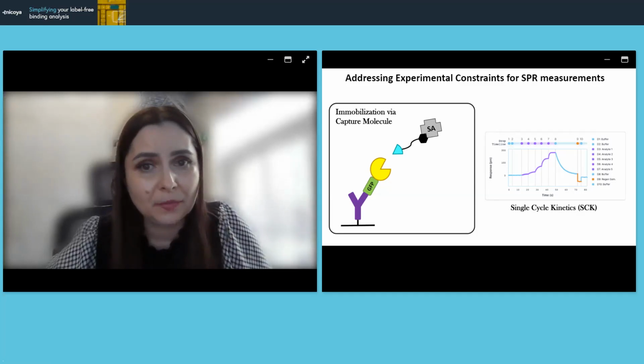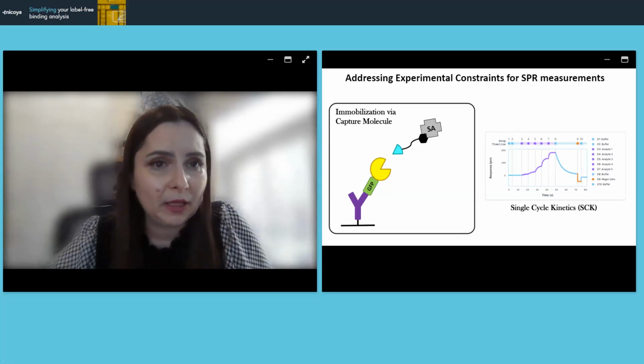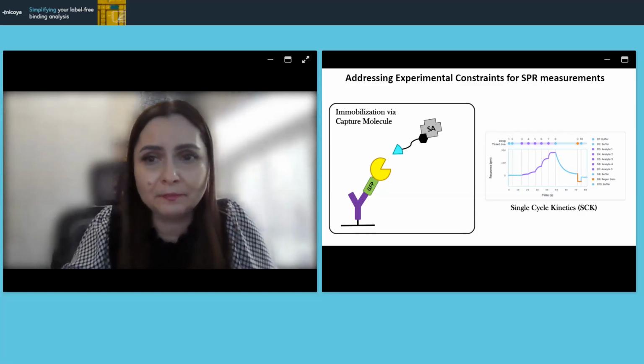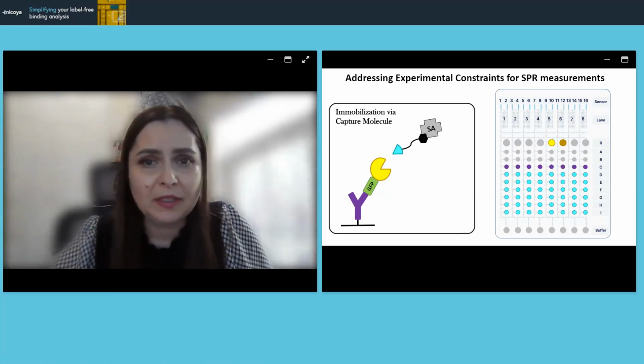Once the protein reacts with the analyte, you can't reuse that protein, and that is followed by the measurement of the K-off, which in our case is a covalent capture, so we don't really care about that portion of the graph. And just to go over the sensor, you can see the color coding: where we put in our antibodies, where we put our analytes, and in yellow the well where we put our protein.